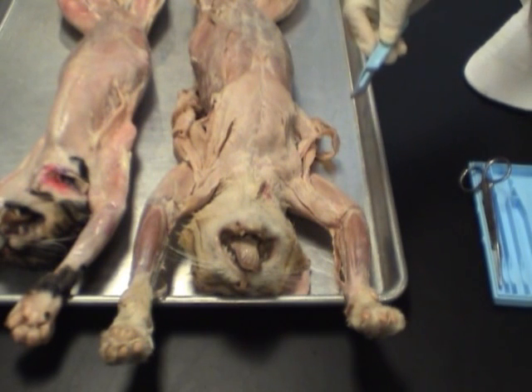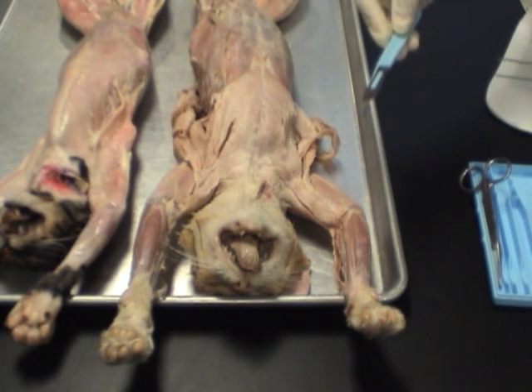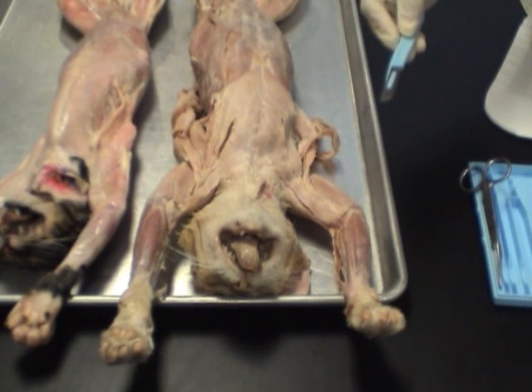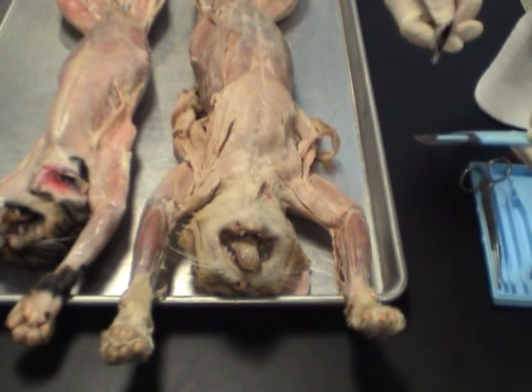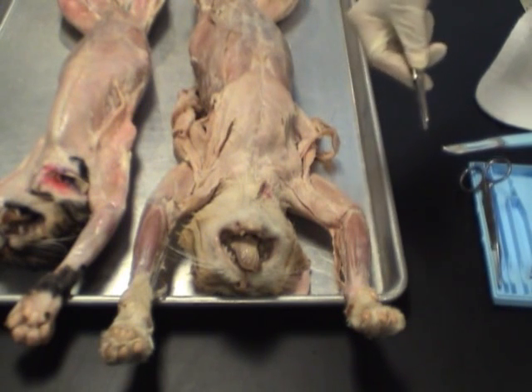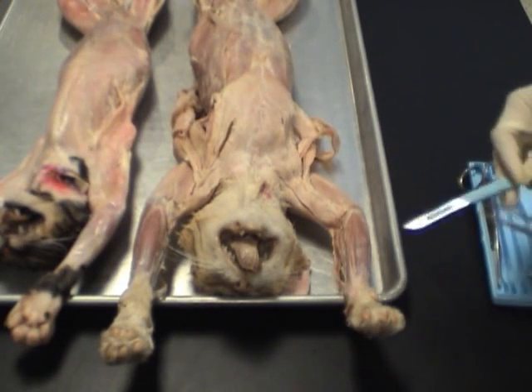The other thing I want to talk to you about is how to change the scalpel blade. Sometimes your box of dissecting kit will come with extra blades. You do not change the blade with your fingers. Okay, you change the blade with the tweezers, the pickups. For example, let's say I want to change the scalpel blade. Well, first of all, you want to hold the scalpel so that the blade is away from you. Then what you do is, here, let me switch hands.